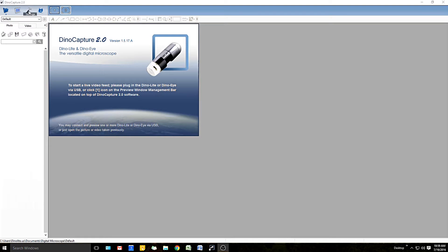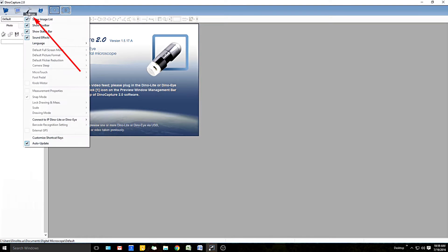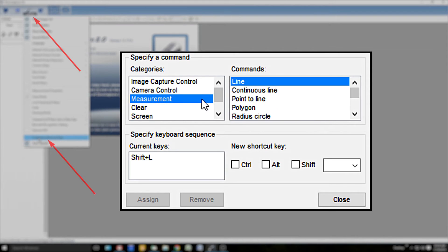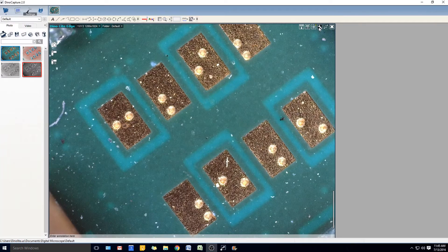Found under the Settings menu, Custom Shortcut Keys allows users to bind specific keyboard keys to quickly perform the assigned commands easily.